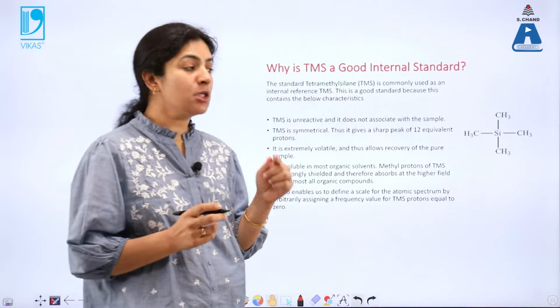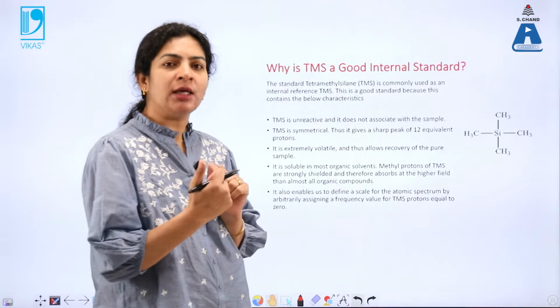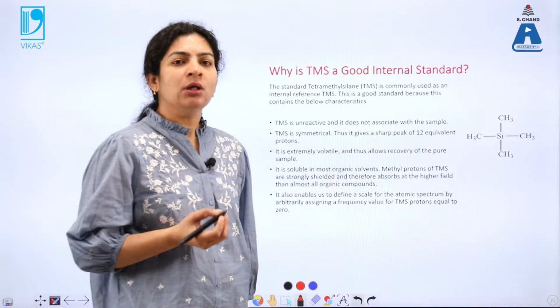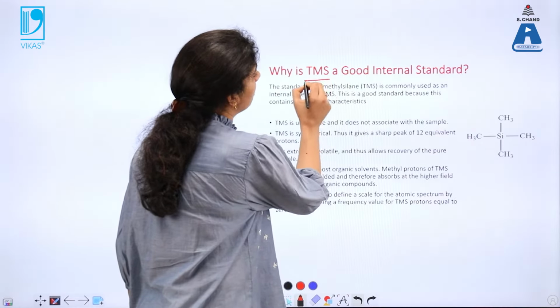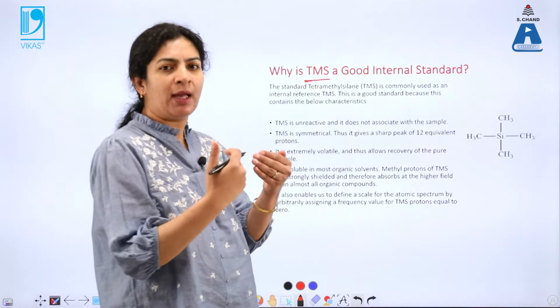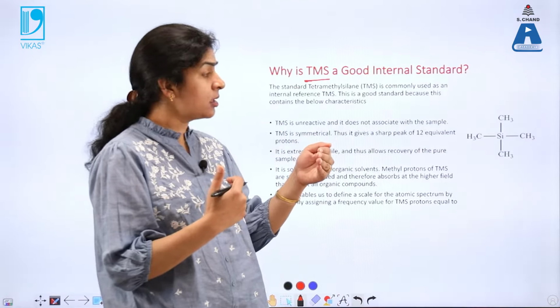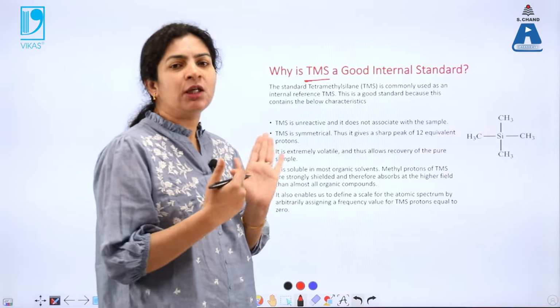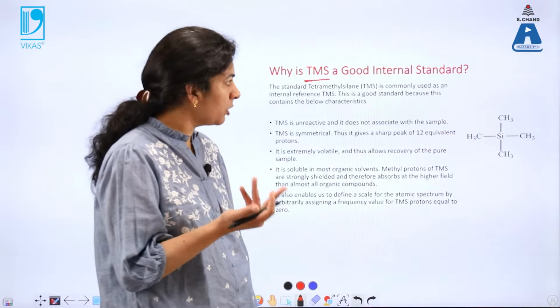And in the formula of chemical shift, if we remember, it is the difference between the frequency at which the proton in a sample absorbs and the reference. So what is a reference? The answer lies in why we need a reference. We need a reference because we then want to compare at what magnetic field strength a bare nucleus will absorb and a molecular nucleus will absorb. But we cannot choose a bare nucleus as reference. We all know that it cannot be chosen.